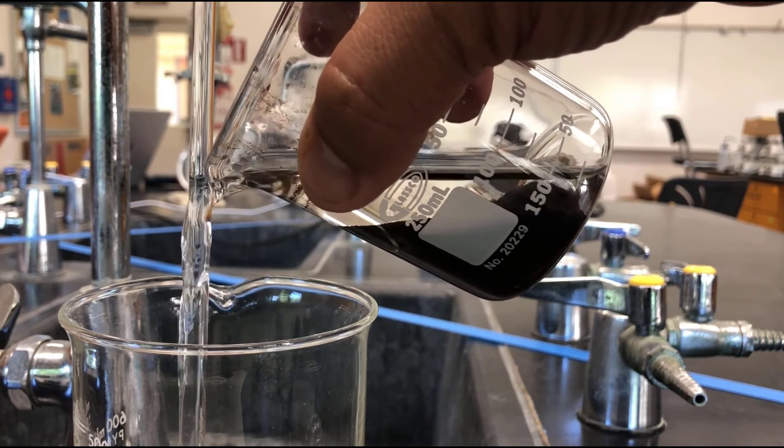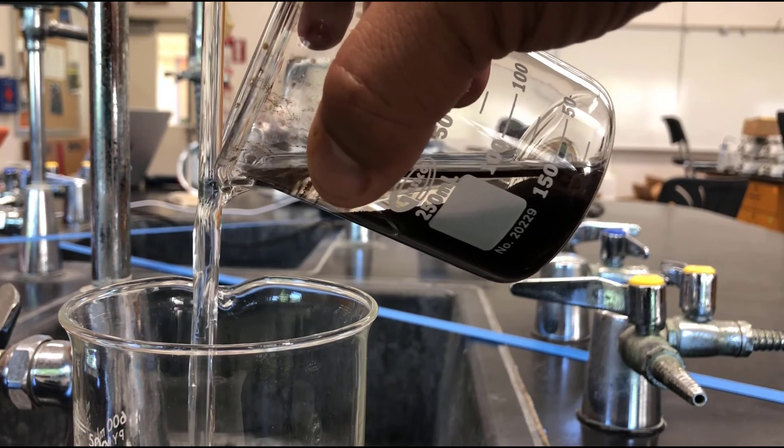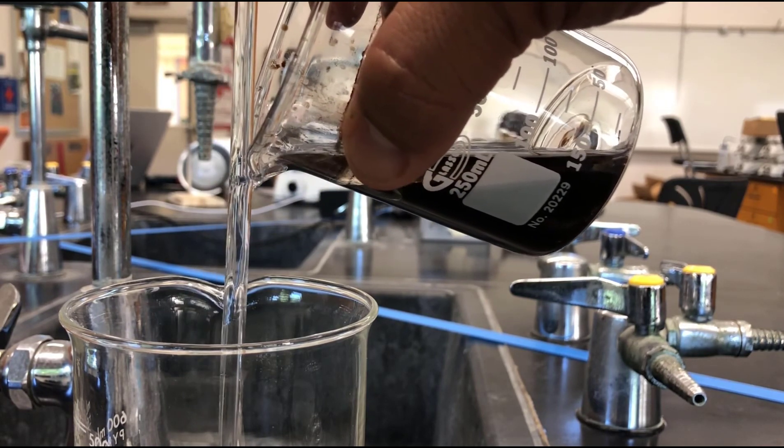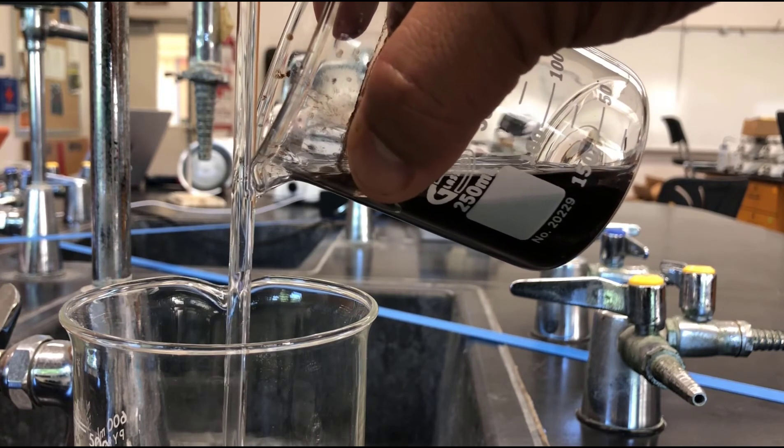The only thing that should be left behind is the copper oxide and a little bit of water. The washing removes most of the other impurities.